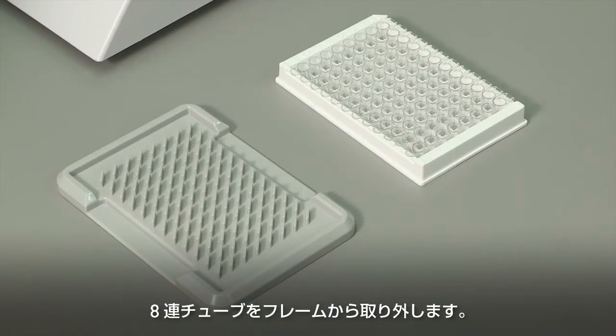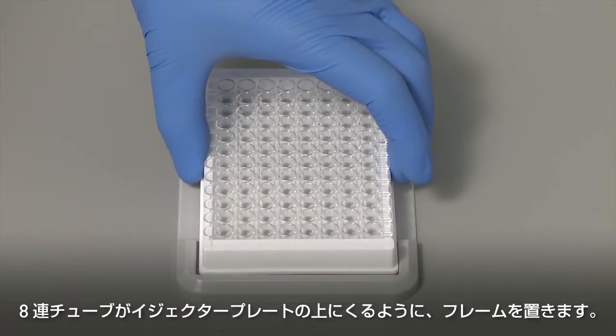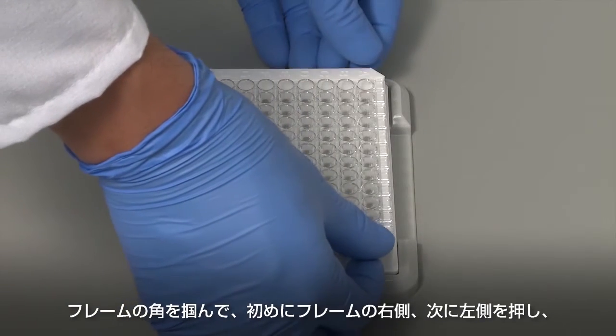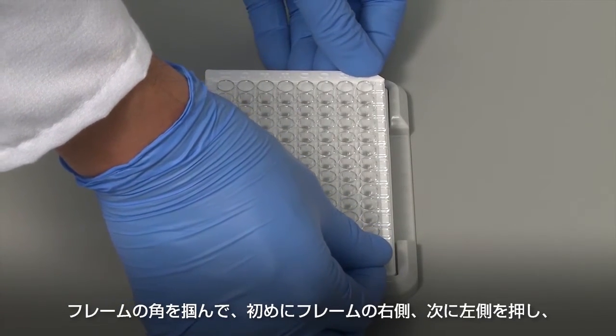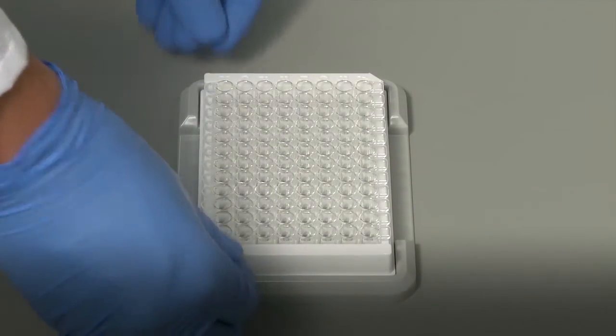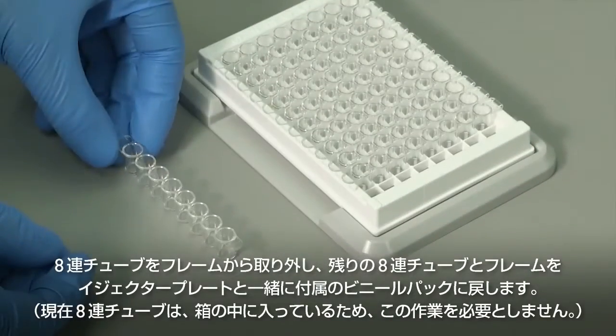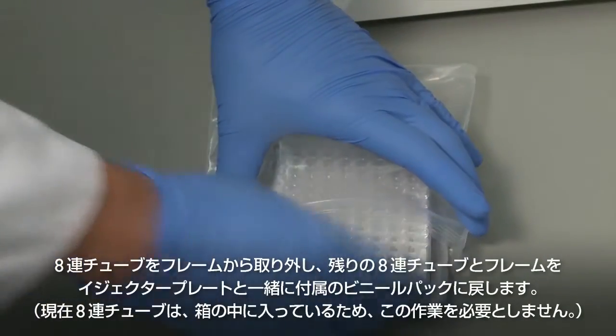Remove an 8-well strip from the frame. Position the frame holding the 8-well strips over the ejector plate. Grasp the frame at the corners by pressing the right and then the left sides of the frame until you see and hear the strips lift out of the frame. Remove the 8-well strip from the frame, then return the frame with the remaining strips to the supplied bag, with the ejector plate attached.